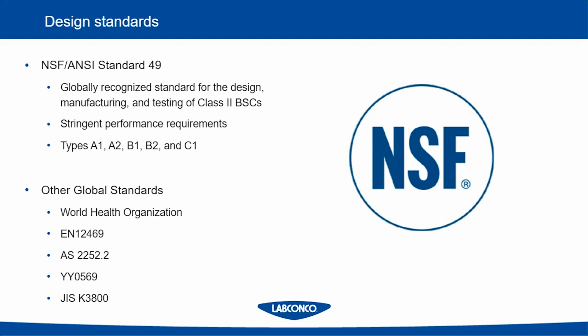There are very stringent performance requirements that all manufacturers must meet to have an NSF listed biosafety cabinet. These include vibration tests, lighting tests, and material construction tests. They include, most importantly, the biological challenges. All cabinets go through a biological challenge with actual bacteria to make sure that they contain and do what they're supposed to do when delivered.